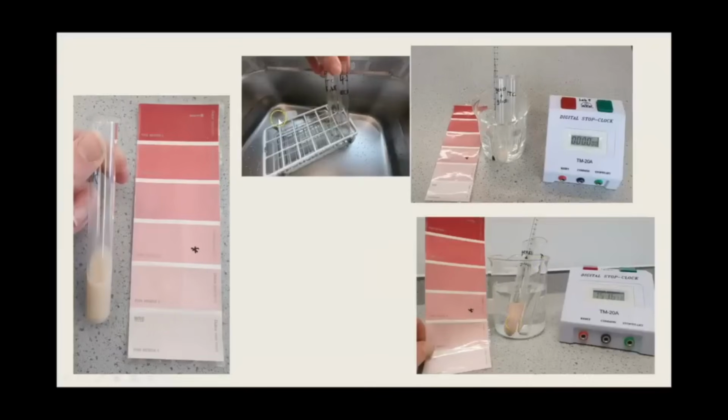Now I did actually use thermostatic ones, but because you can't see into them very well, I've also done one in a beaker as a water bath so that you can see the colour changes. So at the moment, this is at 30 degrees and it's up to 15 minutes, 36 seconds. And comparing it, it's still not quite at the shade of pink that I have highlighted. So we'd still need to leave it a little bit longer. At the moment, it's somewhere in between these 2.